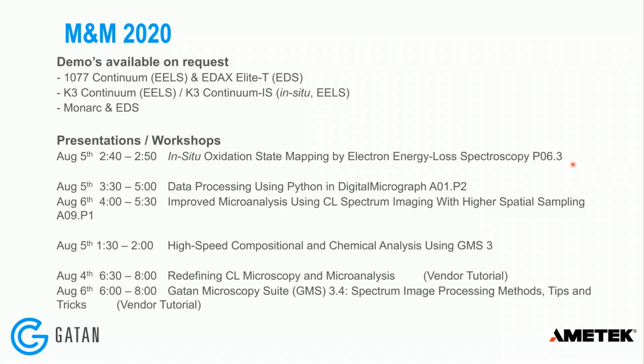So there was a question about DualEELS. You showed the DualEELS application. You said that you read the low loss and then the core loss, but how much time is there between those two acquisitions? Off the top of my head, it's a few microseconds. Oh, it's sub-microsecond, isn't it? Something like that.